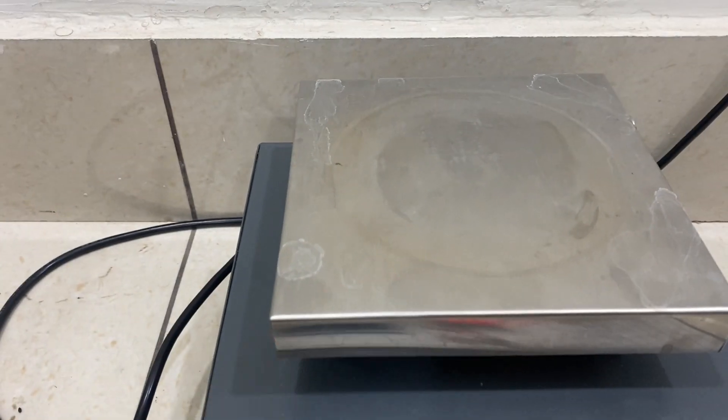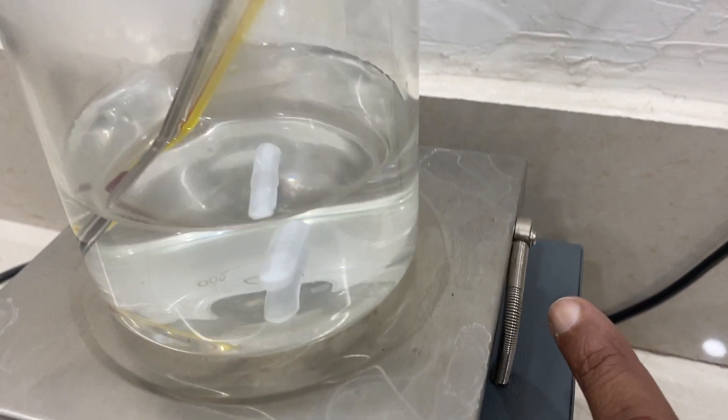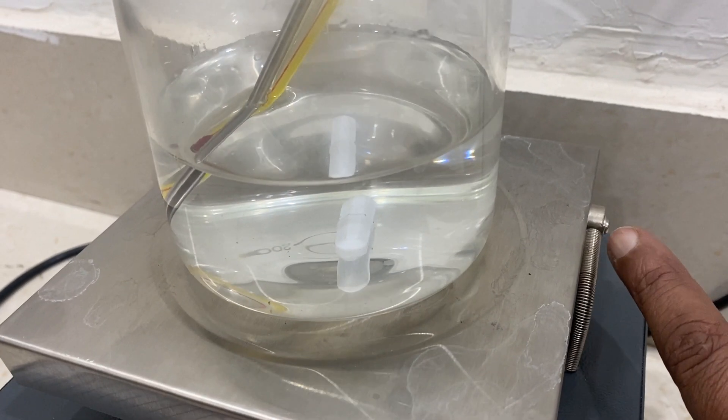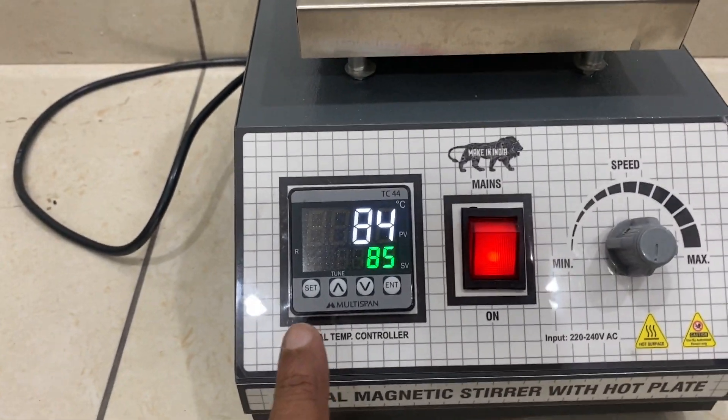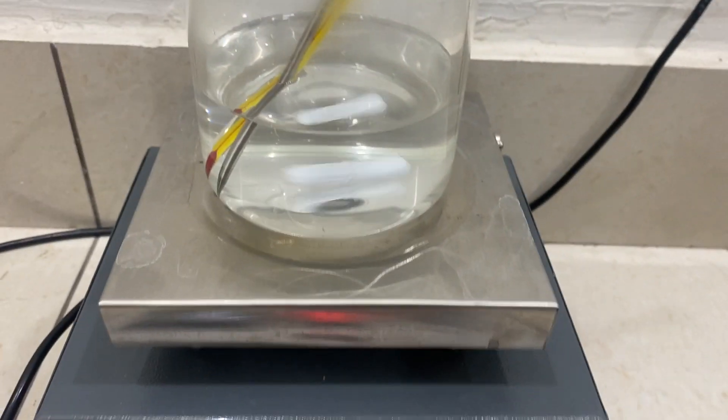The outside is the heater section, which is very hot. The temperature is controlled by this display. There is a probe for checking, setting the temperature, and seeing the temperature. You can increase this.